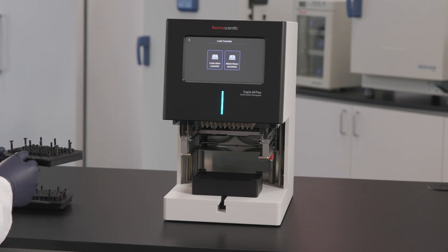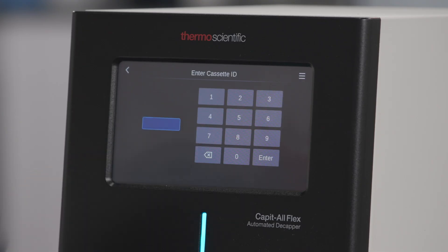If another cassette type is selected, you will be asked to enter the cassette ID. You can find this on the cassette label. The cassette will then be installed and the instrument will be ready for use.